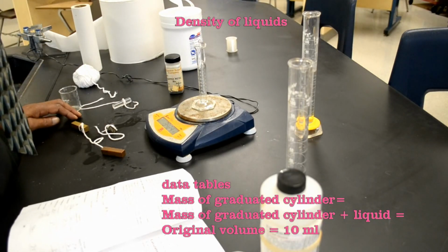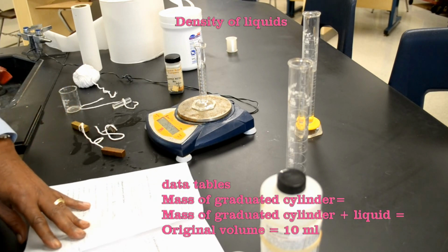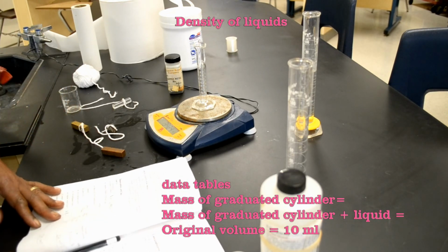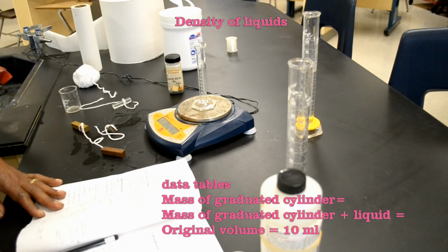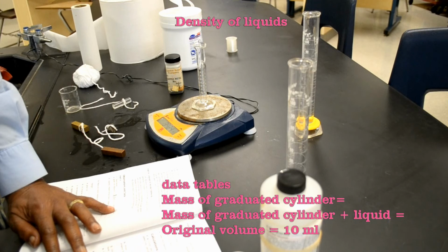Now add about 10 mLs of distilled water to the cylinder. Measure and record the combined mass of the cylinder and the water. The mass of the cylinder is 39.24.